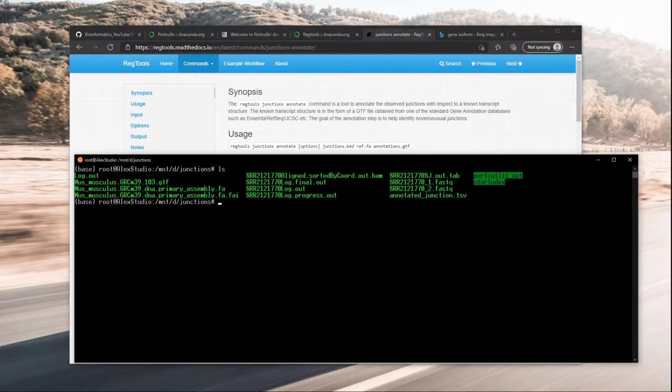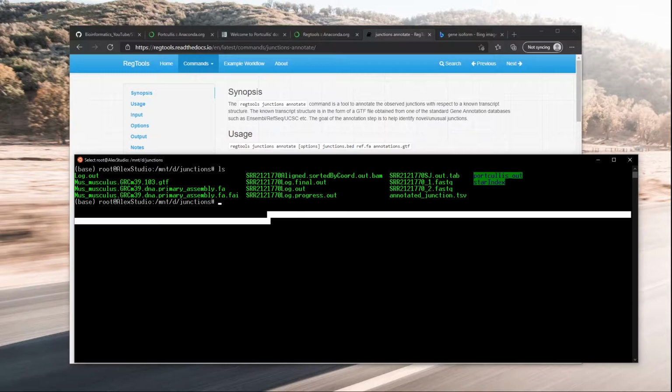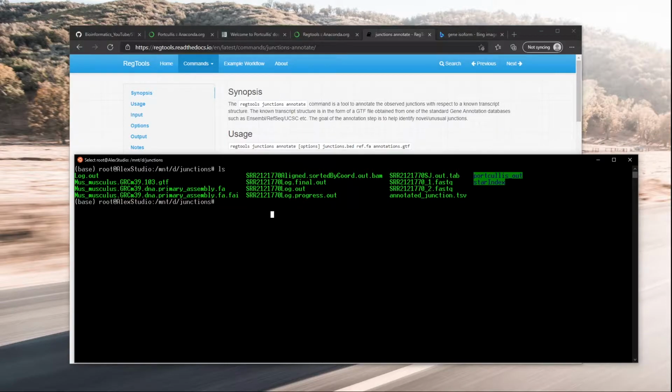So yeah. In order to install Portcullis, something that I want to make note of here is that I was not able to get it to work in my virtual environment, which is why right now I'm on my main computer. The Python versions and everything were the same, which is really frustrating. But in order to install Portcullis, all I had to do on my main computer was conda install portcullis, right?